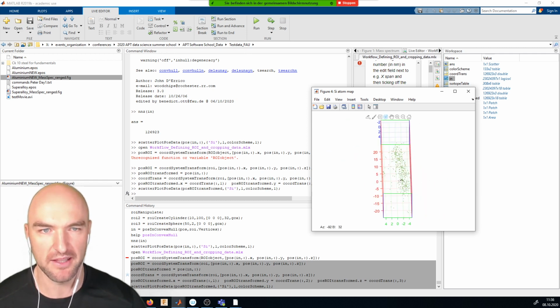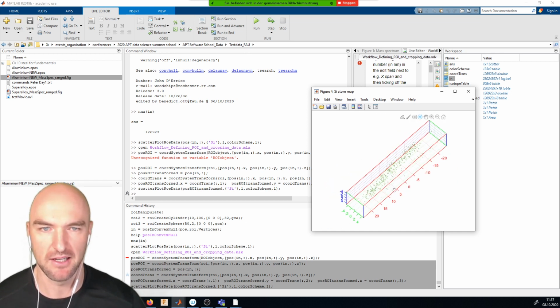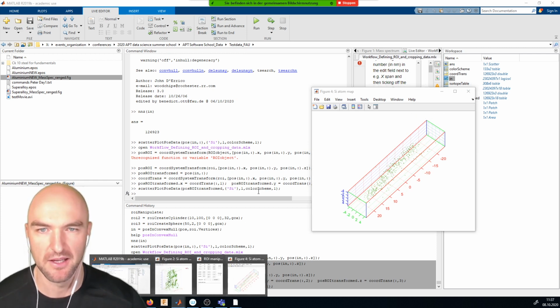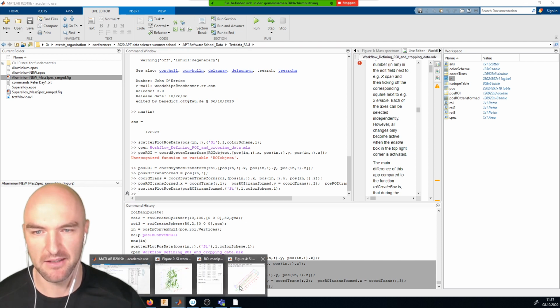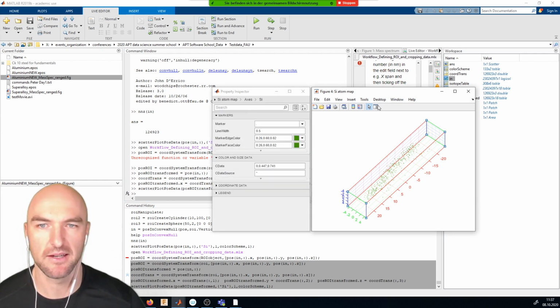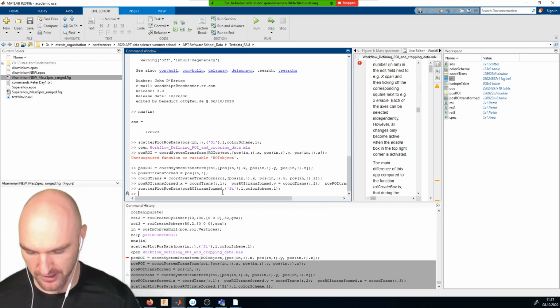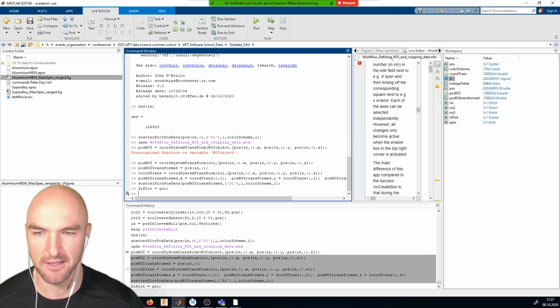But I've promised you that one of the nicer things we can do is actually do a display that updates with us moving the region of interest. And the way we do that is that we can go and assign that scatter plot here to a variable. Did I create the, yeah, we have gotten the scatter plot. So we can call that silicon plot. It is that object that we have just selected. This is our silicon plot.